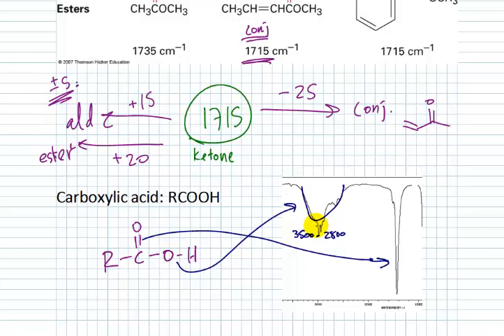But honestly, a good way to tell if you've practiced this enough is where you can look at a spectrum and figure out, for the most part, what functional group is present without looking at too much else. You'll obviously be able to spot an alcohol pretty easily up in here, and a carbonyl pretty easily in there. Amines are easy to spot. They have very characteristic shapes that we saw before. And then the hybridization of CH bonds will be really easy to spot.